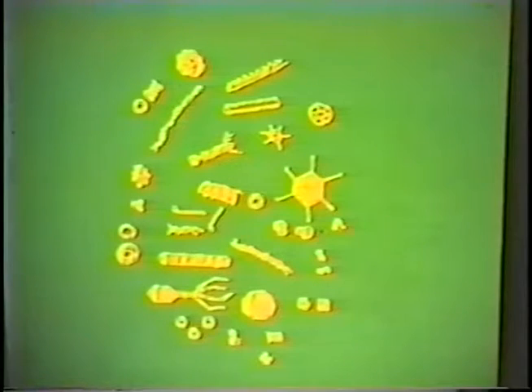Because of the problems of bringing to the US dye solutions and pieces of glass, I've simply produced some reverse contrast images from a black and white diagram of viruses and proteins. I've used different colors to represent the different negative stains. For instance, the negative stains do not interact with our hypothetical biological samples. Here in our model, we have the hypothetical samples of biological material surrounded by a green stain. It could just as well be a different hypothetical negative stain.